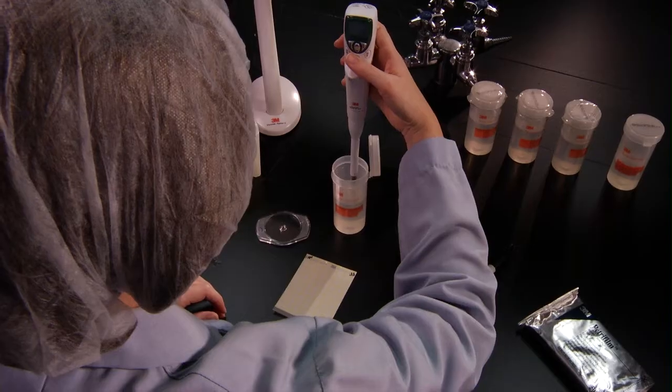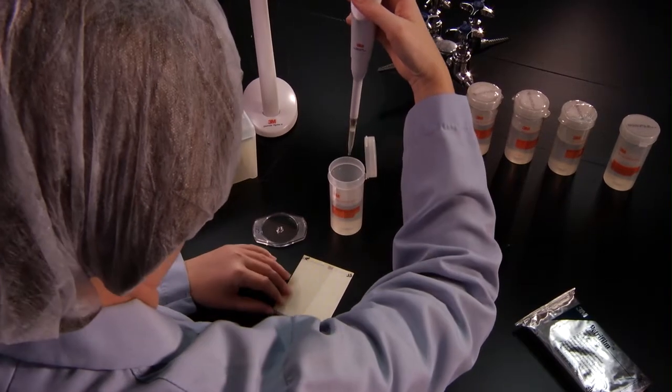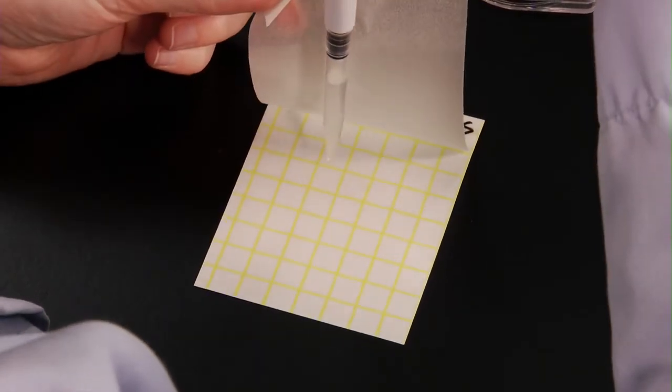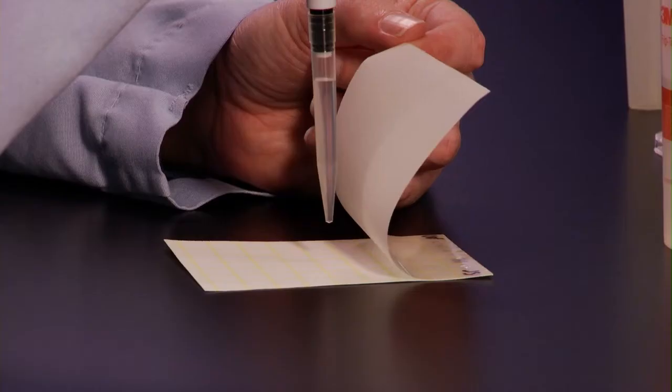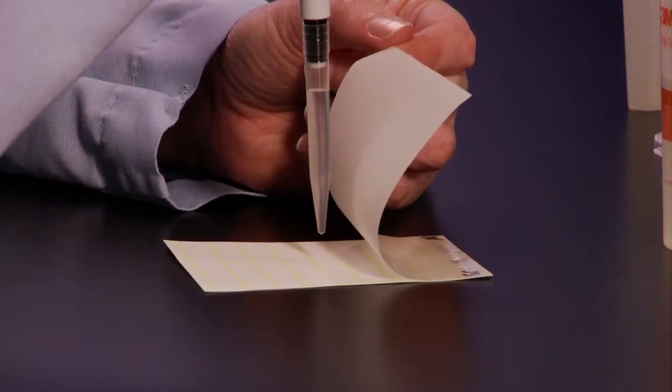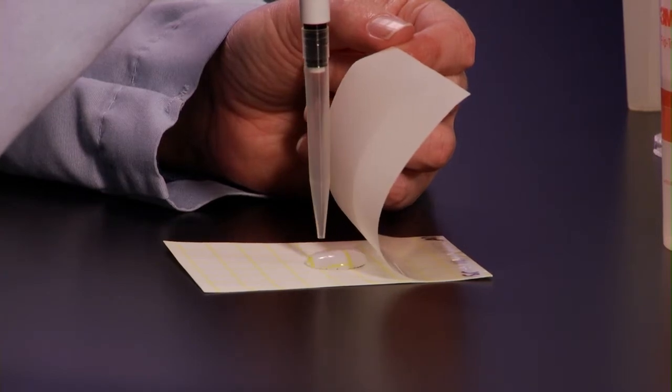Draw 1 milliliter of the sample into the pipetter. Lift the top film and hold the pipetter perpendicular to the 3M PetriFilm plate. Pipet the sample onto the center of the bottom film.